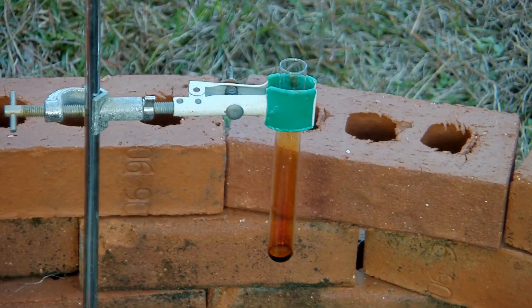Hey YouTube. Today's video is going to be a short one about the reaction between elemental bromine and aluminum. In the test tube there I've got probably half a milliliter of liquid bromine, and to that I'm going to add some crinkled-up aluminum foil and we'll see what happens.